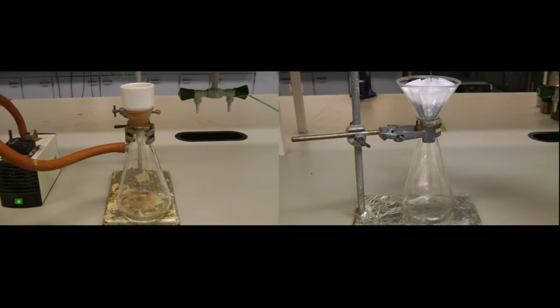A vacuum is used to drive the filtration process rather than gravity. Consequently, vacuum filtration is much faster.